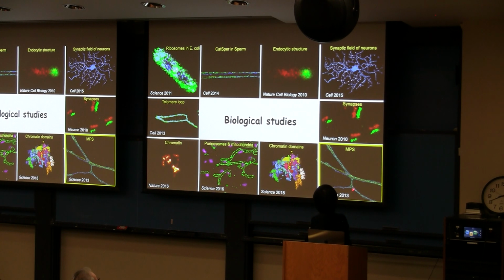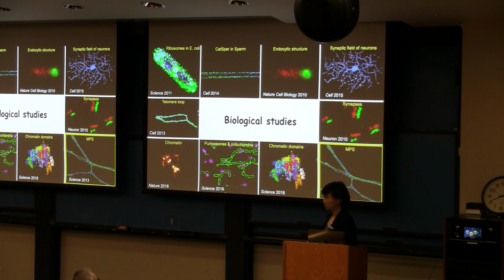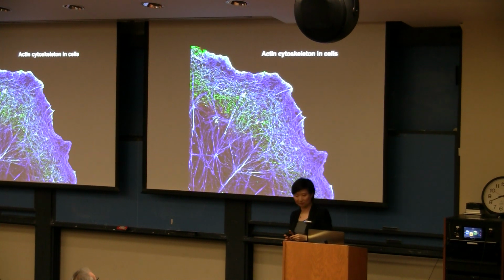So these are just some anecdotal or quick snippets, but I want to focus on one discovery that we've made by super resolution imaging, because it demonstrates that with super resolution imaging, we can not only get sharper and prettier images, we can even discover structures that we didn't know existed in cells before. And that has to do with a skeletal structure that we discovered in neurons, and that started with our studying of actin. So let me give you a little bit of background.